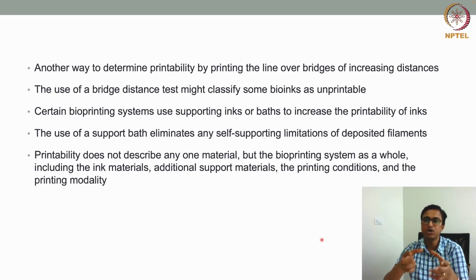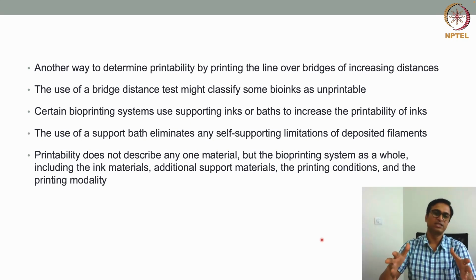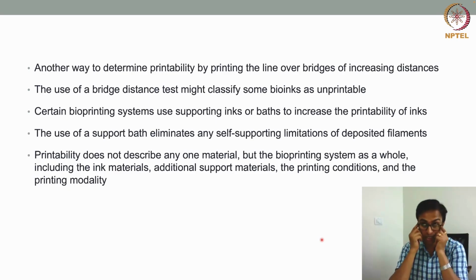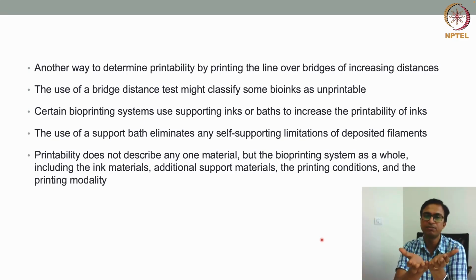We have seen that support bath materials are like Bingham plastic, where they are solid unless you put pressure on them. When you are dipping in the nozzle and plotting the material within the support bath, the support bath actually holds the material, because when the pressure force is gone, they again become solid.